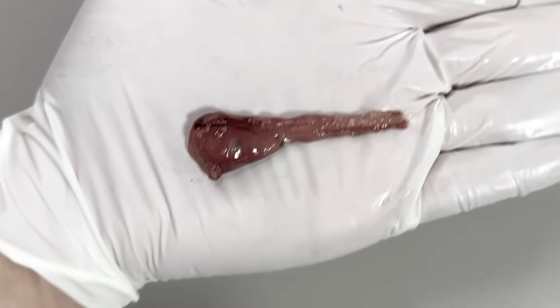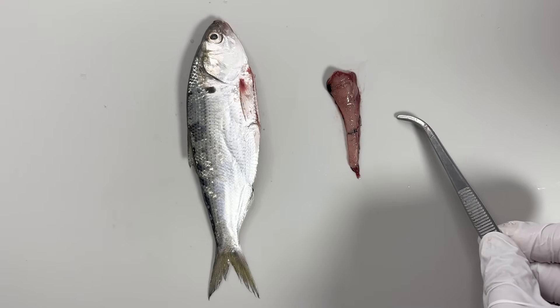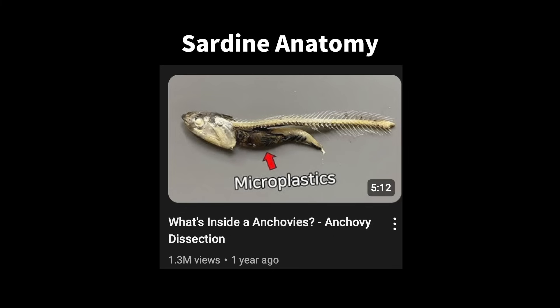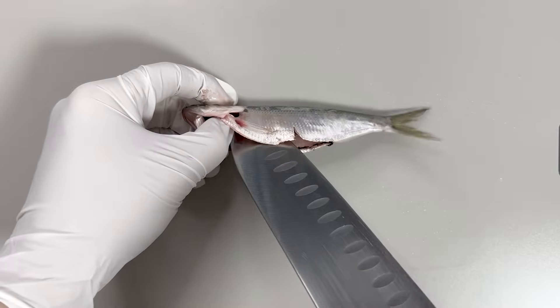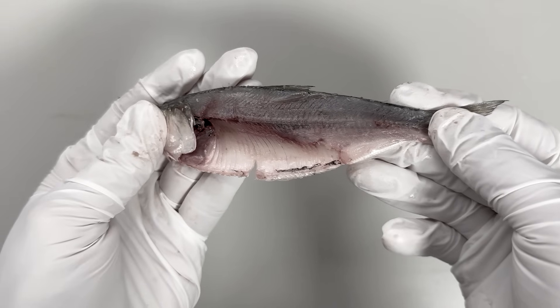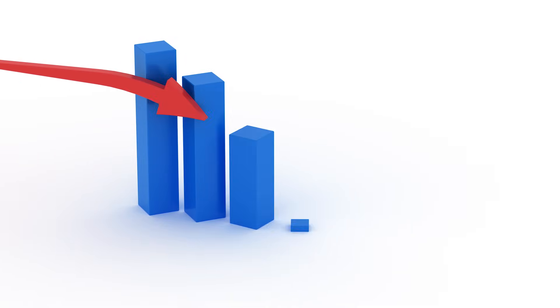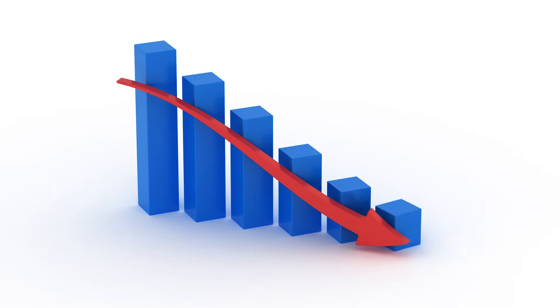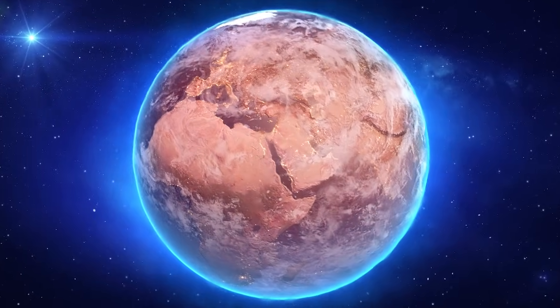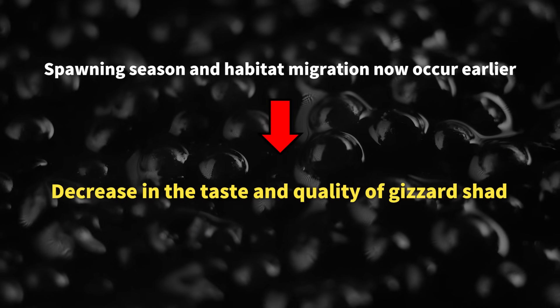Curious, isn't it? The rest of the digestive organs have a complex and intertwined shape. If you are interested in the detailed anatomy of bony fishes, please also check out our videos on sardine anatomy. And if you cut the muscles of a Gizzard Shad with its internal organs removed, you can view the longitudinal section of the body as shown here. Lastly, I have heard that the population of Gizzard Shad has been rapidly decreasing, and their taste is not as good as it used to be. This is due to changes in their spawning season and habitat caused by the rise of sea temperature from global warming in recent years.